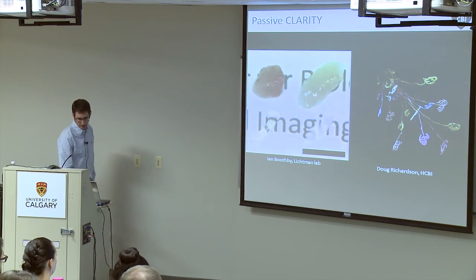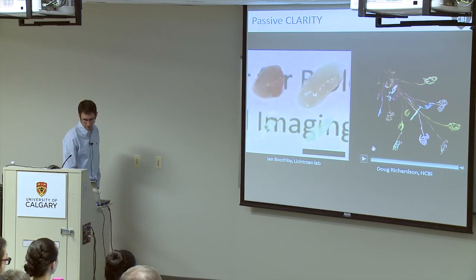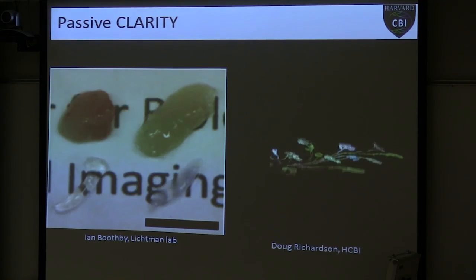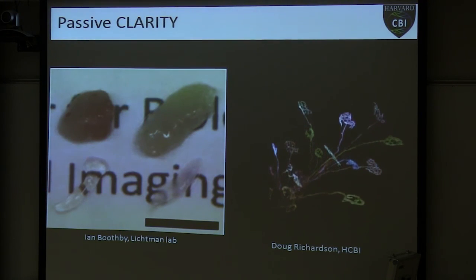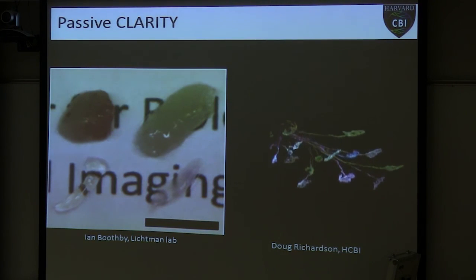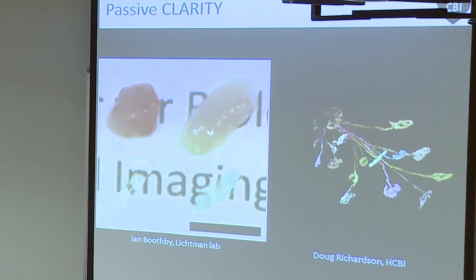All right? And this was a Brainbow sample. Not necessarily brain, but it was a Brainbow sample. So this is just labeling the neuromuscular junctions within that skeletal muscle. So this was just imaged by confocal afterwards.